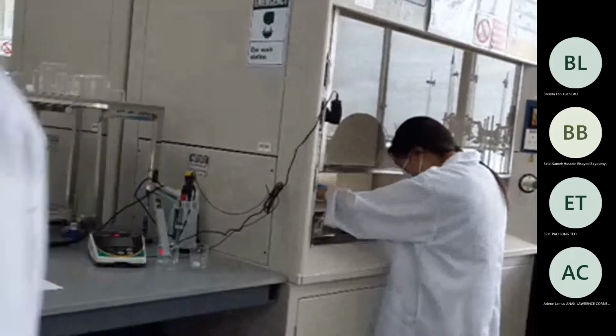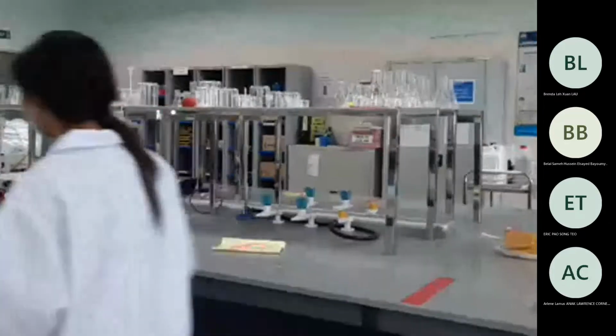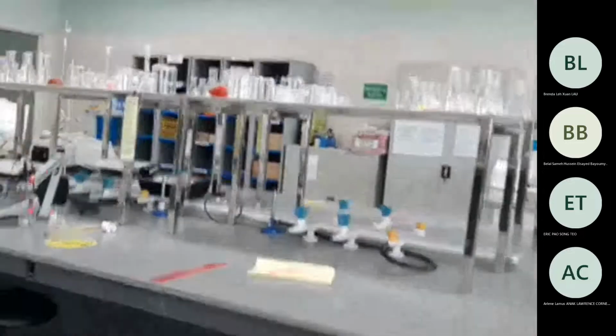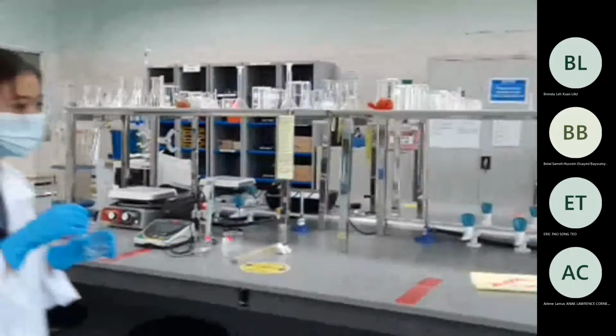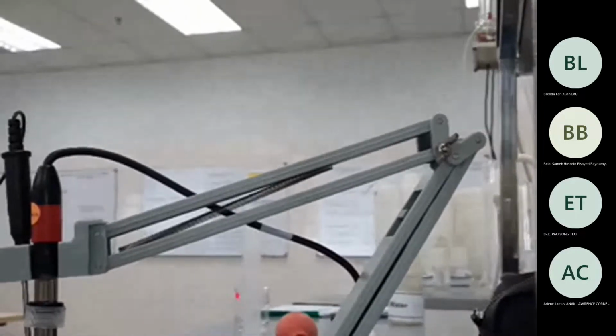Sodium hydroxide, 5 drops. I just leave it on Noor's plates so that everybody can see, hopefully.